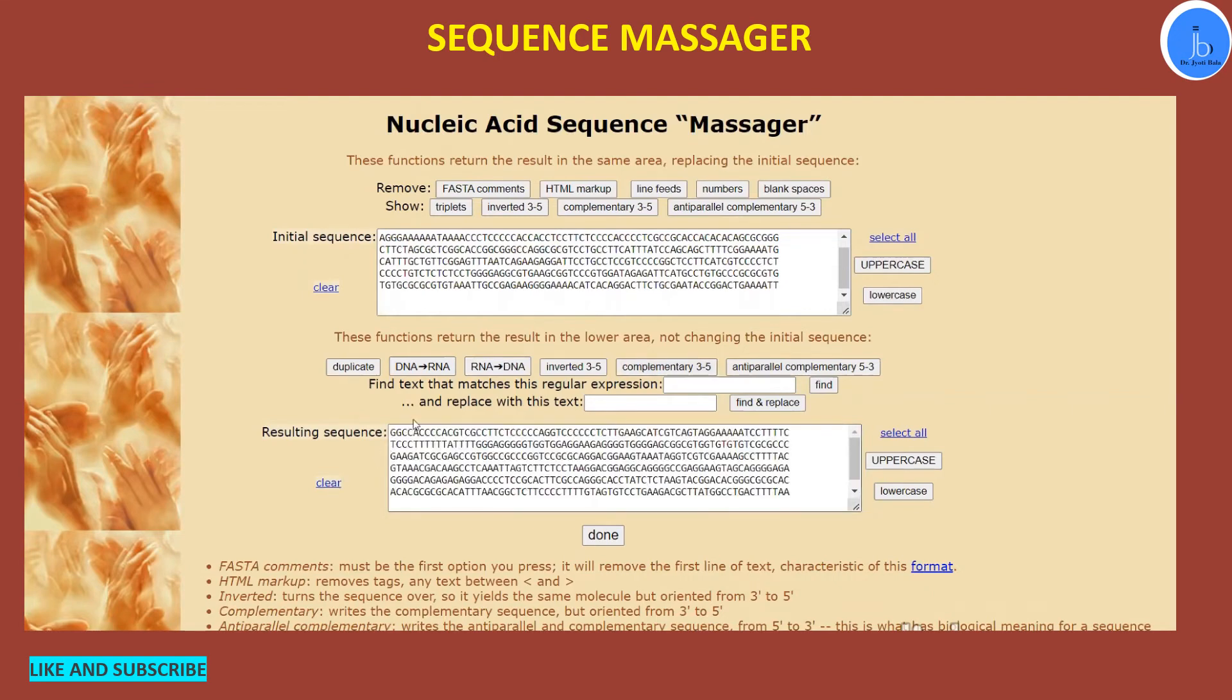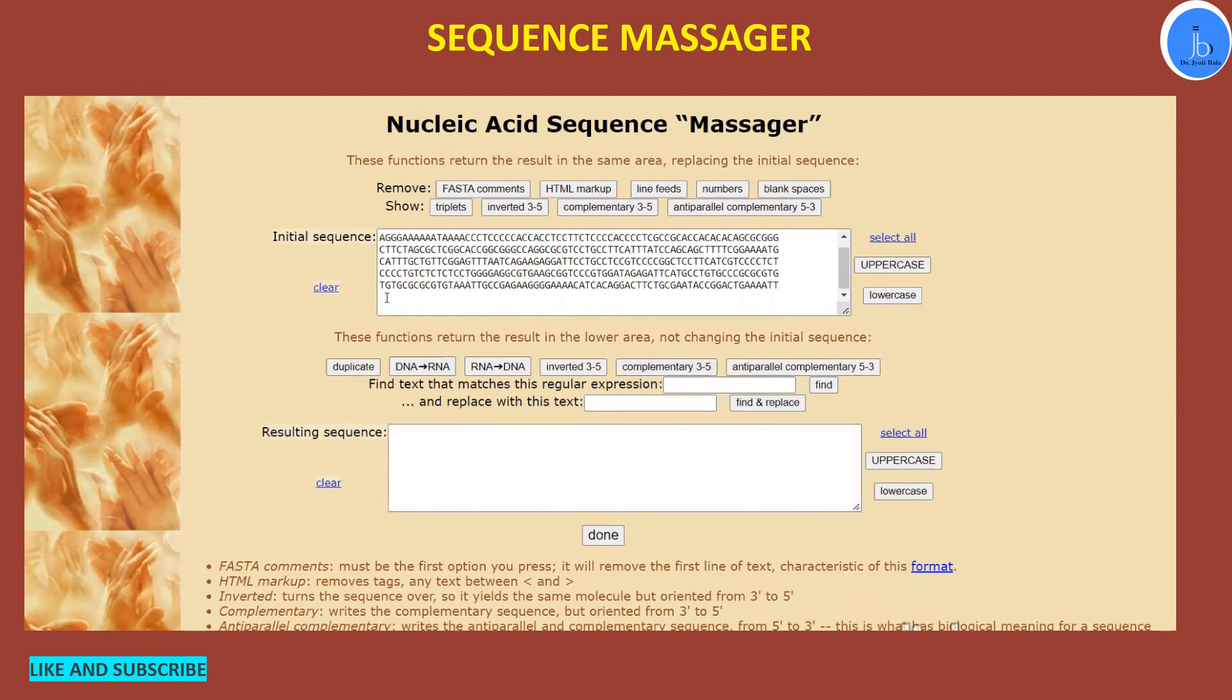Similarly, if you want this DNA to be converted into the complementary strand, that also can be done here. If you want to duplicate or you want to invert these things, because genes are like 5' to 3', sometimes your significant sequences are from 3' to 5', so if you want to invert them, that is also feasible from here.